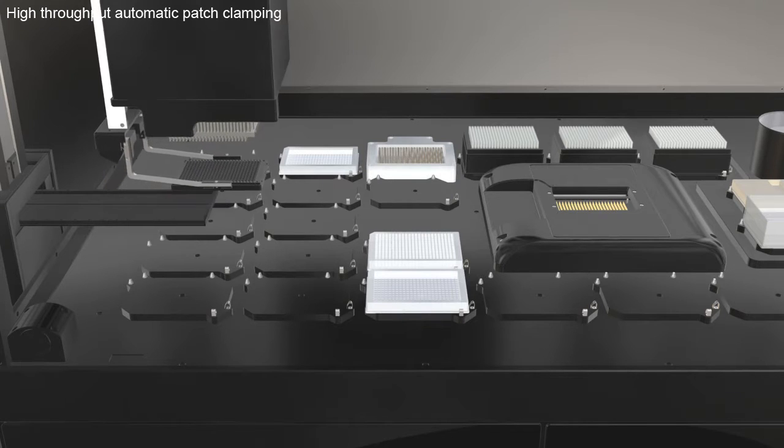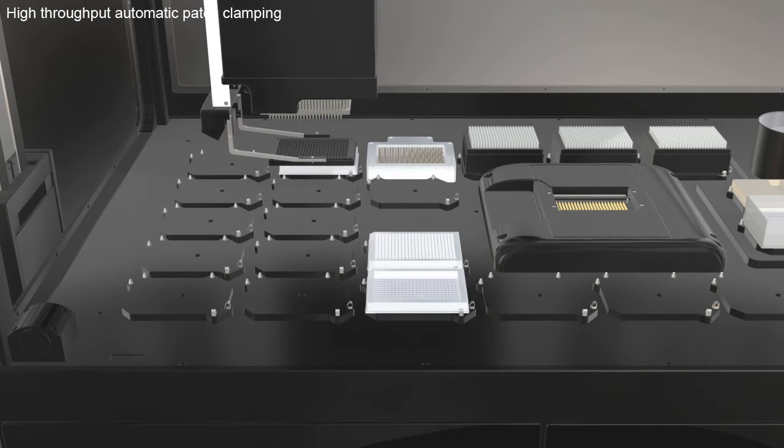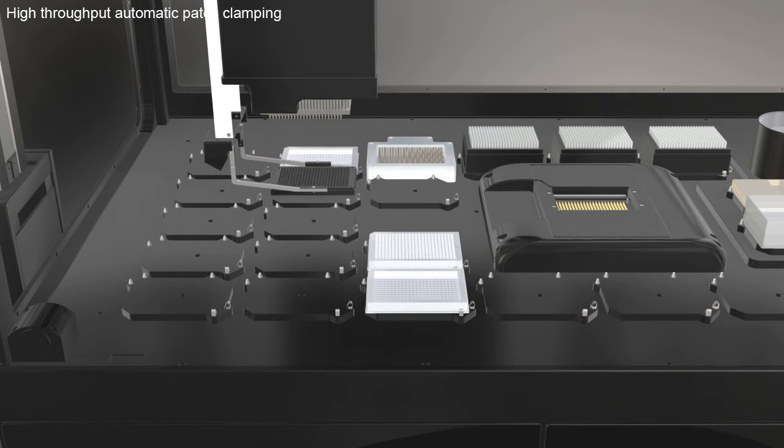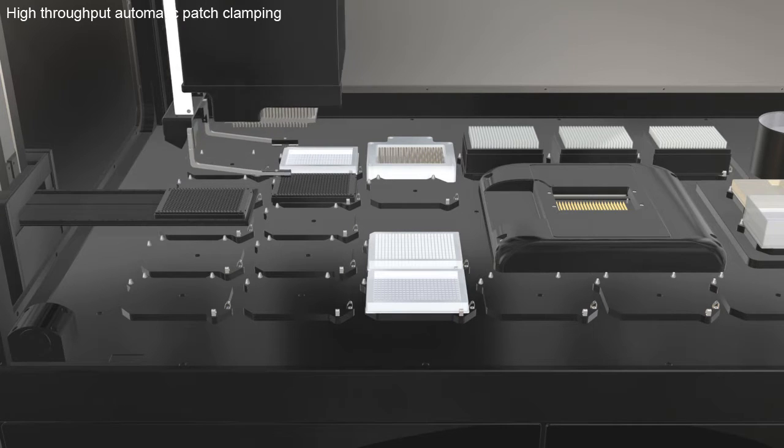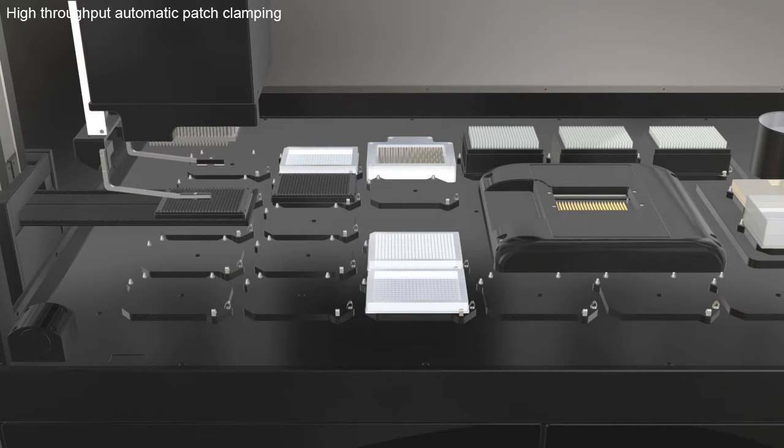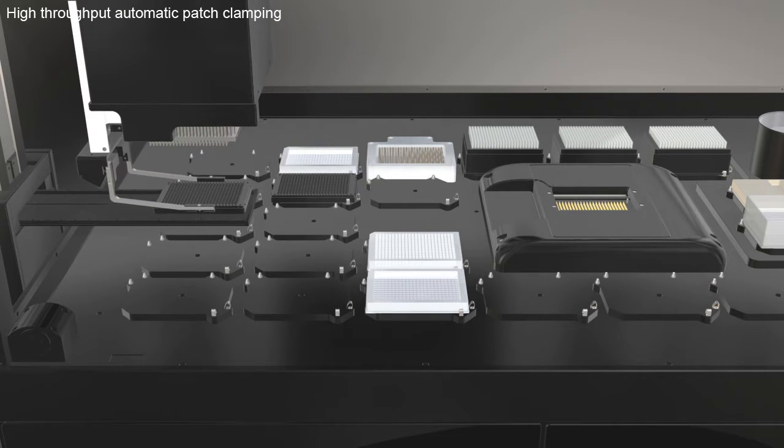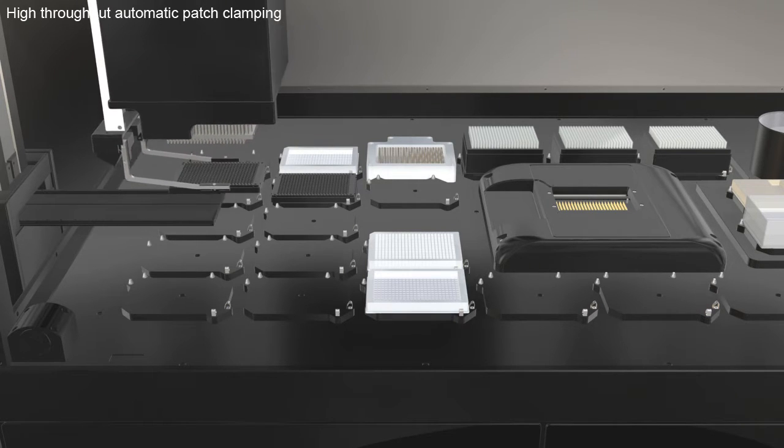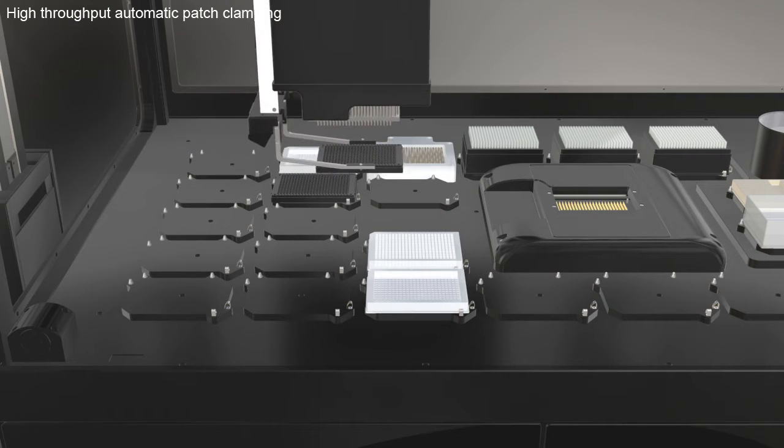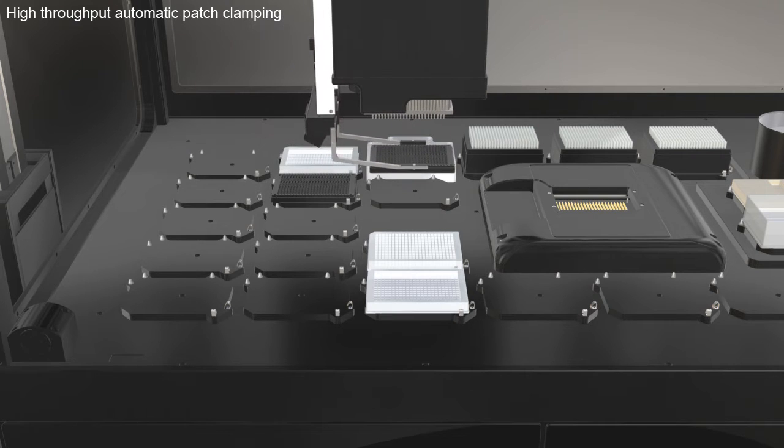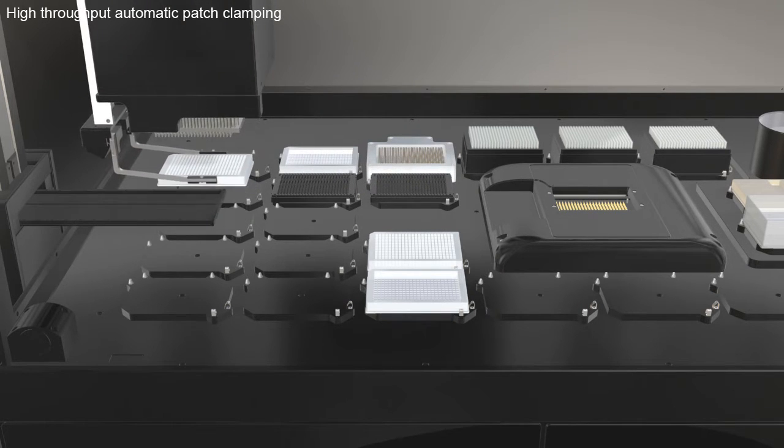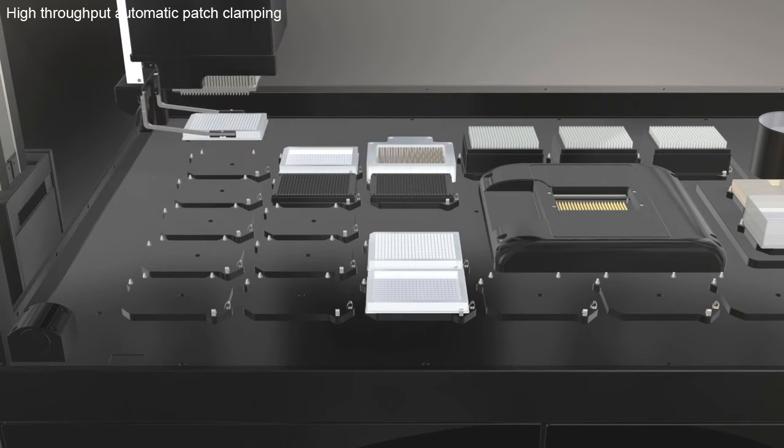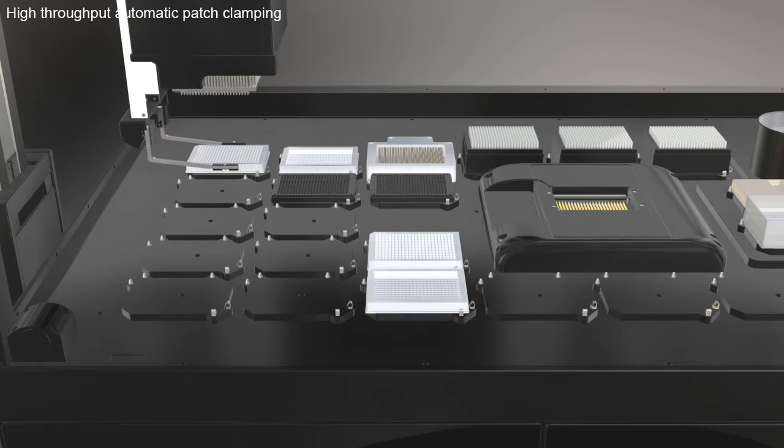A stacker delivers Q-Chips for the experiment. The stacker delivers user-defined compound plates that will be screened.